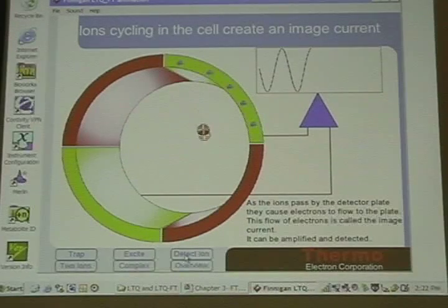Now remember, it's not the FT that's opening and closing. That's constant. It's the LTQ that's trapping for long periods of time. The trapping happens on the LTQ. You fill the trap, and then you just send it all back and dump it down. So it's not the ICR cell that's staying open for long periods of time. The ICR cell is open for the flight-time-based length of time. Okay, you got that in your head? The AGC is always on the linear trap.